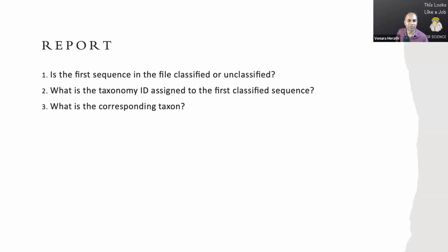Randika, you are looking at the wrong file, the other file. You need to look at the report file. There are two files you get as your output, but you are looking at the wrong one. The other file contains a lot of numbers, like the example I showed you.